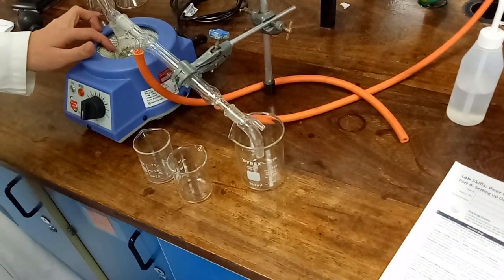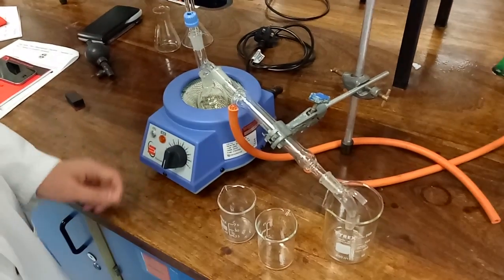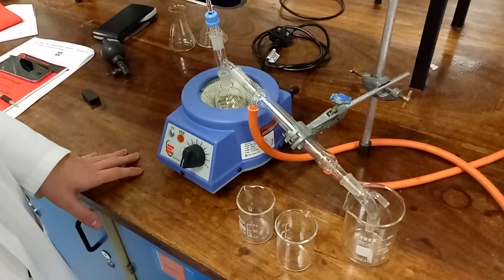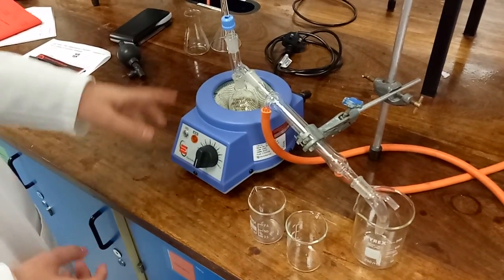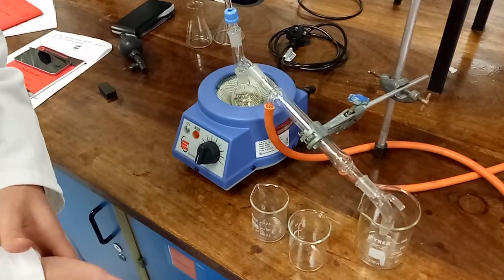Before it distills to nothing, we turn off the heating mantle, because if there's no liquid left in the flask, you're in danger of an explosion.